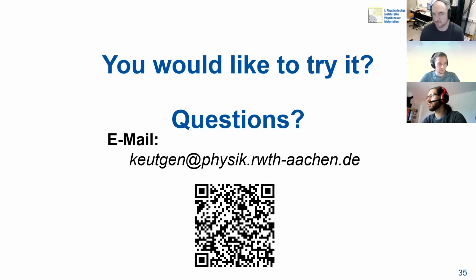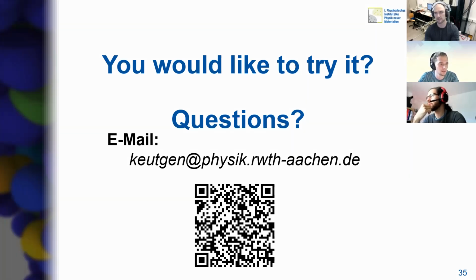I think we've got time for one more question, just in the last minute. The question is, for people who can't generate EPOS files or don't have the capability, how might they go about interacting with your software directly if they don't have access to IVAS? If they can't generate EPOS files, I think they just would need to contact me. Once they have the data, it's quite quick to create a new script that imports different file formats. Up to now it wasn't really necessary, so there's nothing in there yet, but I'm happy to provide something for people who would need it.